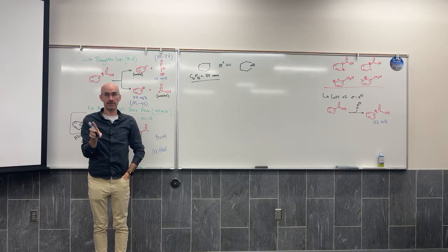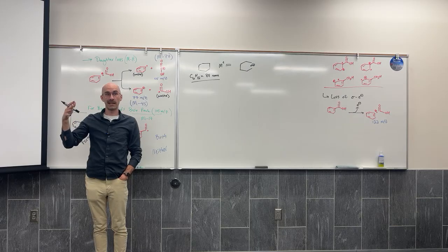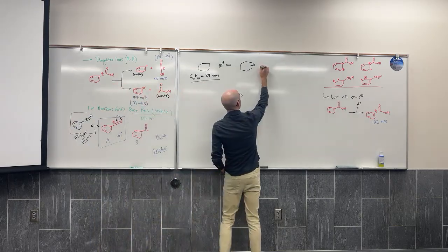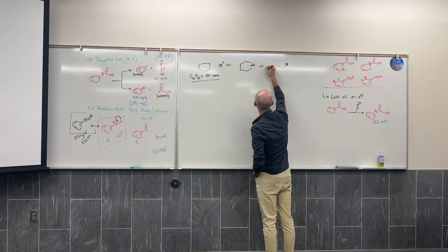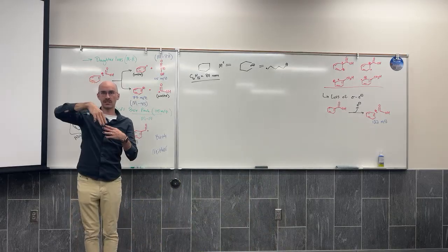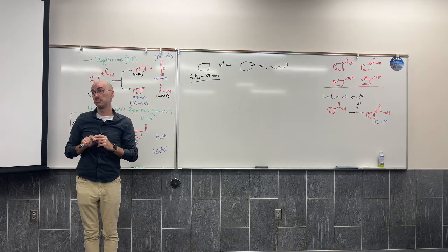Kayla did something very interesting, which probably is one of the reasons why the molecular ion for this ring is so intense and why it's so stable: even if this breaks and one carbon takes the radical and one carbon takes the cation, they stay on the same structure. They just go from a ring shape to a linear shape, but it's still a radical cation.